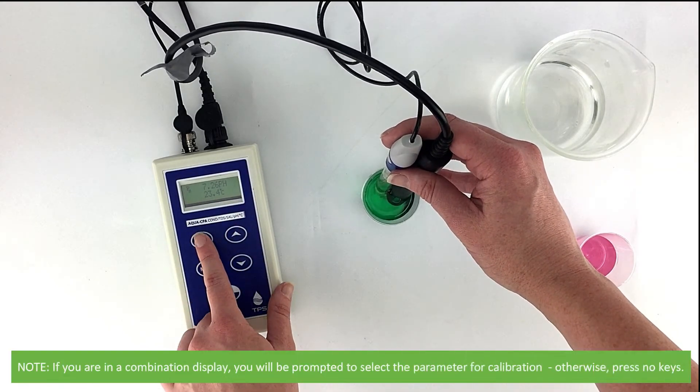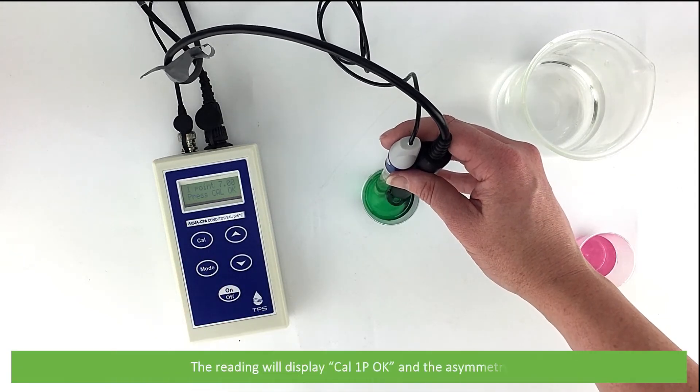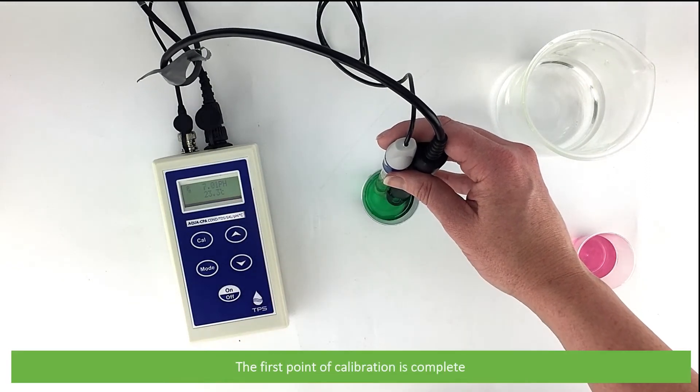If you are in a combination display, you will be prompted to select the parameter for calibration. Otherwise, press no keys. The reading will display CAL 1P OK and the asymmetry. The first point of calibration is complete.